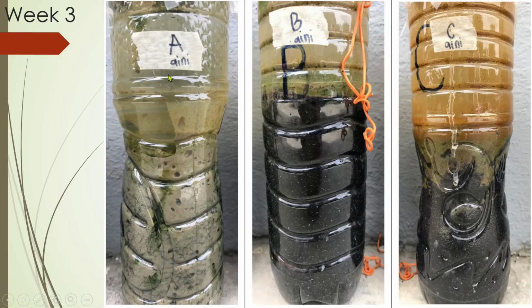Then by week 3, the differences between the columns begin to show. Here and here are essentially dark, whereas for the control column, the phototrophs have covered throughout the Winogradsky column.